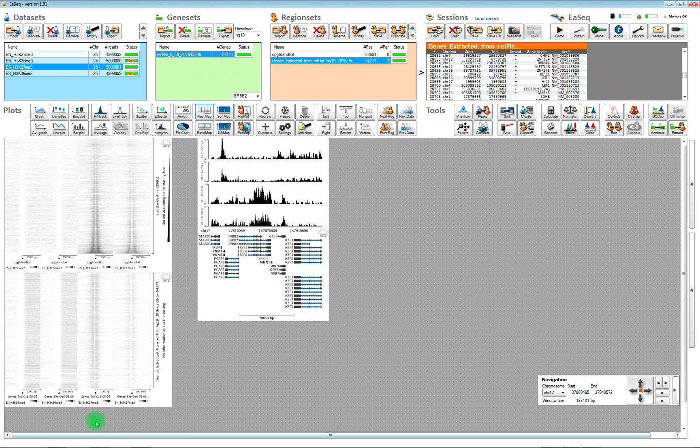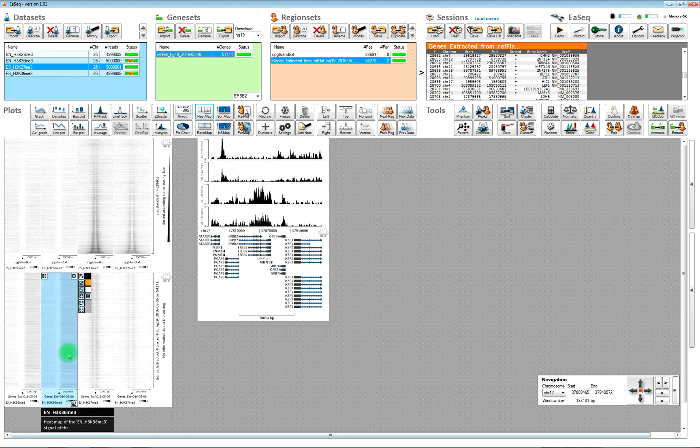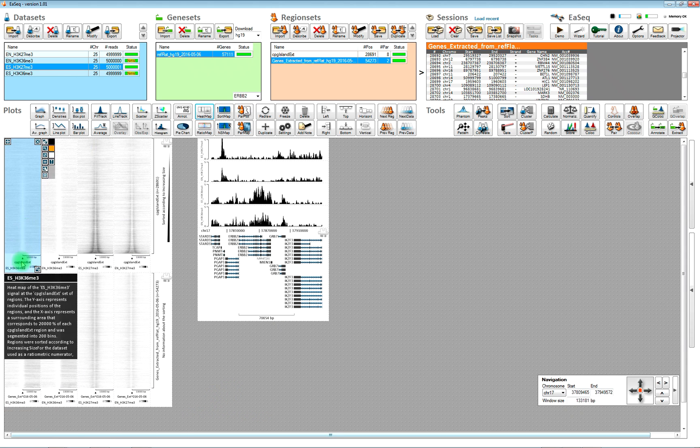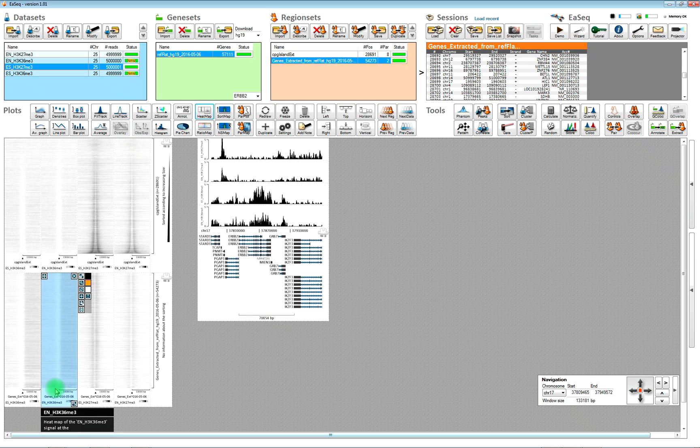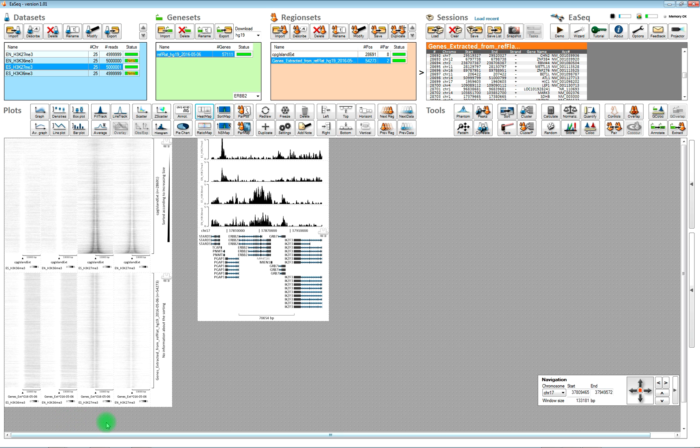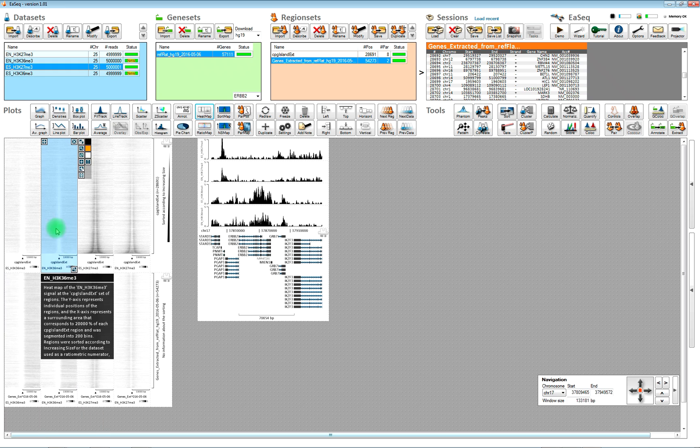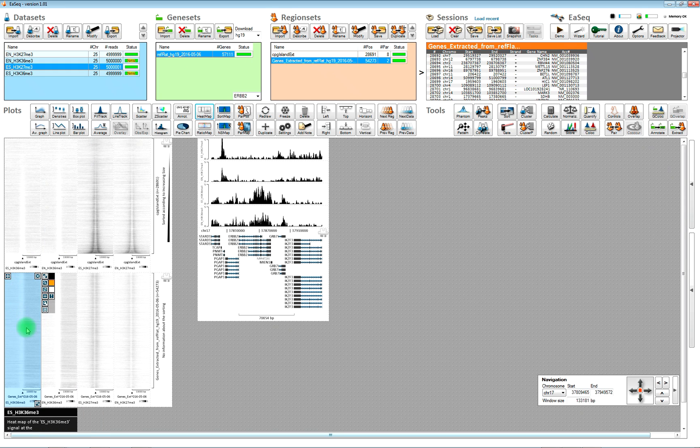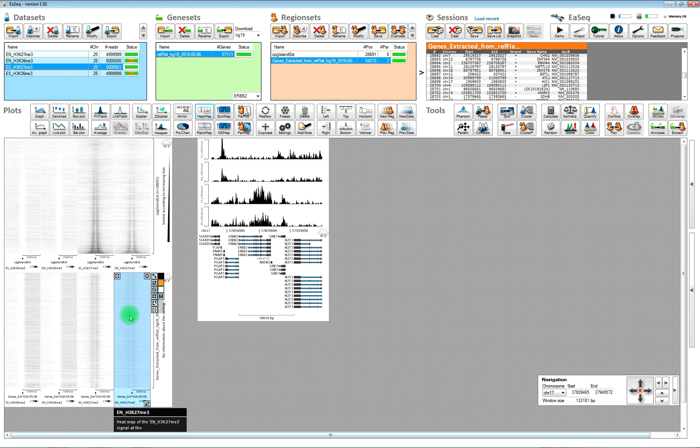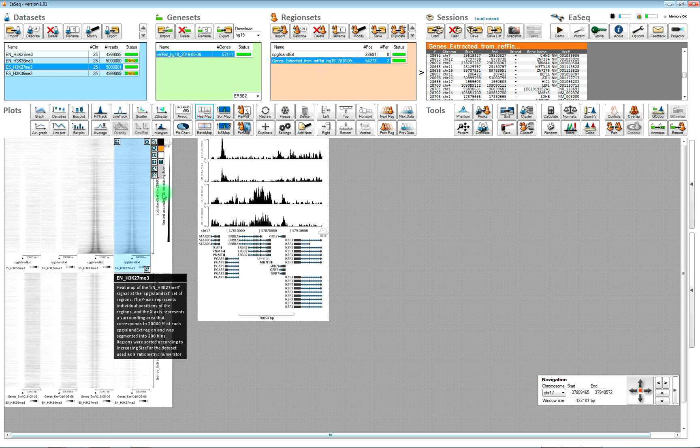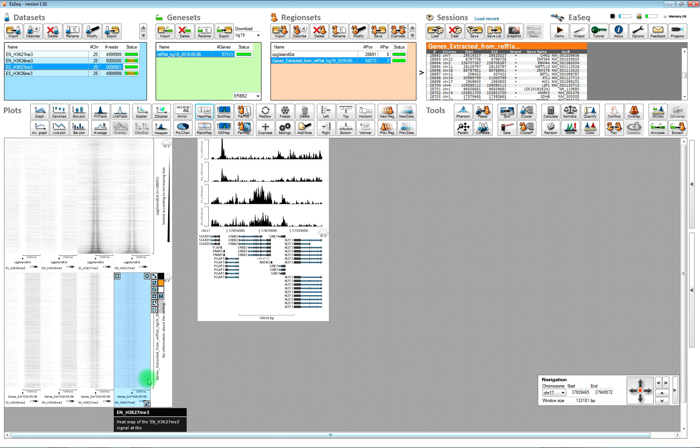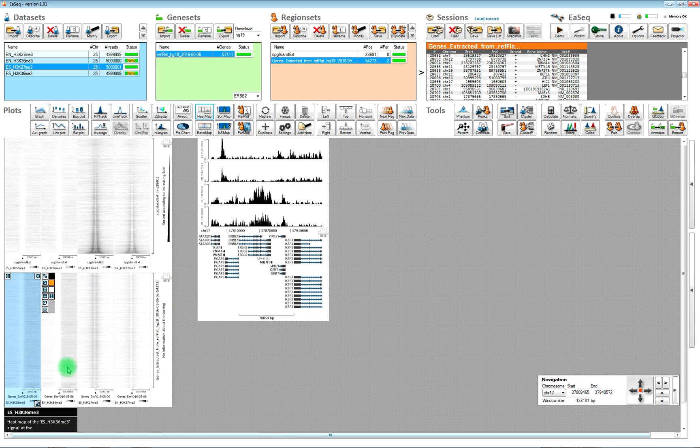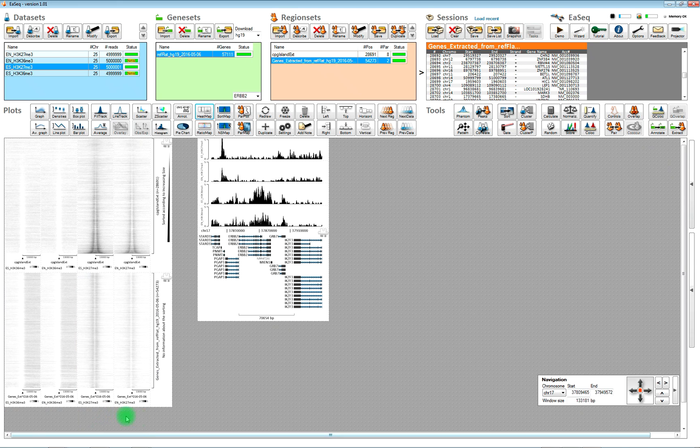So we have K36 over here and we have K27 trimethylation over here. So now it matches the order. We have K36 trimethylation here. And we have K27 trimethylation here in these four plots. Up here we are looking at the CPG islands. Down here we are now looking at the transcription start sites.